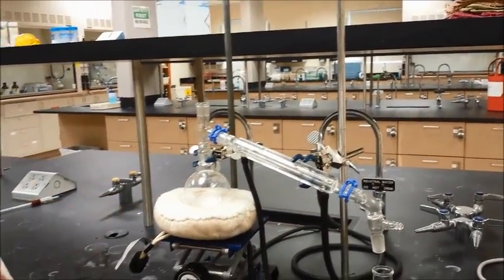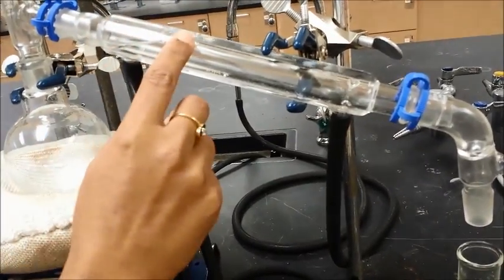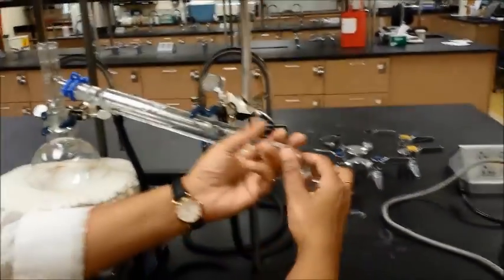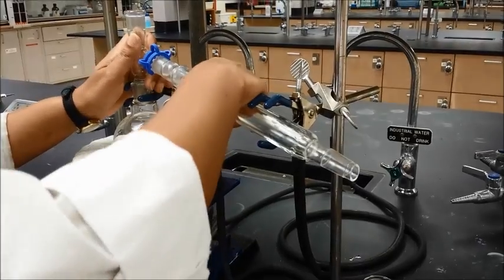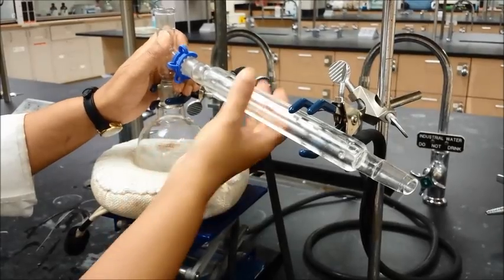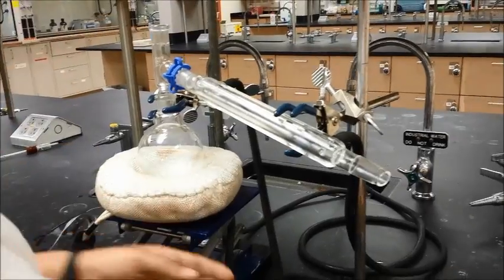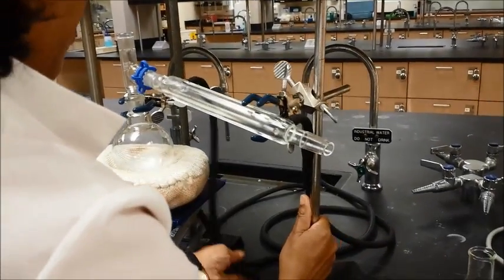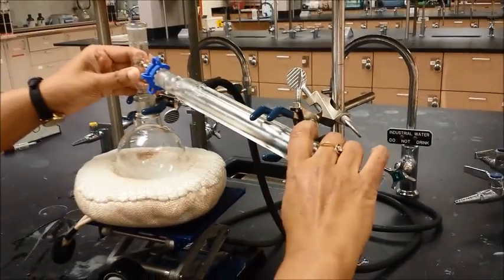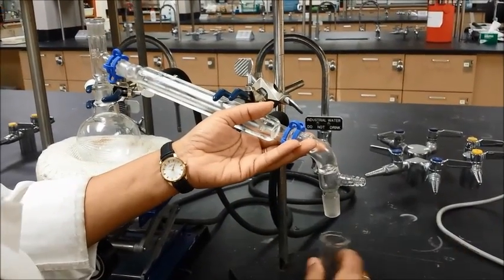One other thing: the condenser right now may not be completely full of water. At this point you may need to remove the tube and twist your condenser in such a way that it actually fills up with water. Make sure you don't twist it so much that there is a kink in the tube and no water gets through. There should be a good flow of water with no kinks in the tube. Once that's all set, put the tube back on.